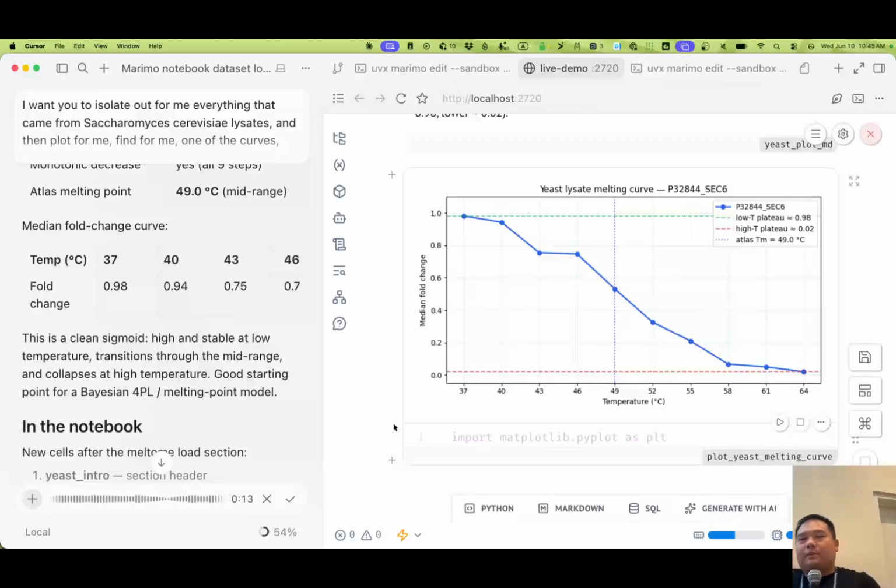We'll just do it for this one protein first and try to see whether we can estimate the melting temperature with uncertainty of this particular protein. You should note that the absolute upper and lower bounds really should be 1.0 and 0.0. So there shouldn't be any ambiguity about this one, unlike in other experiments, for example, where the upper and lower bound value might not be well defined.